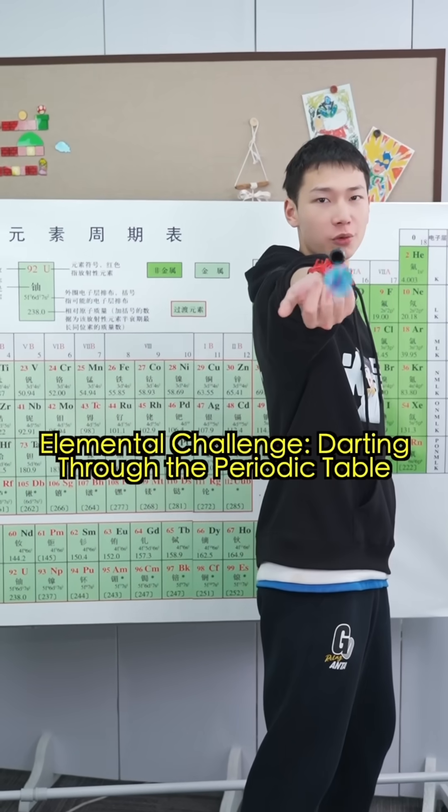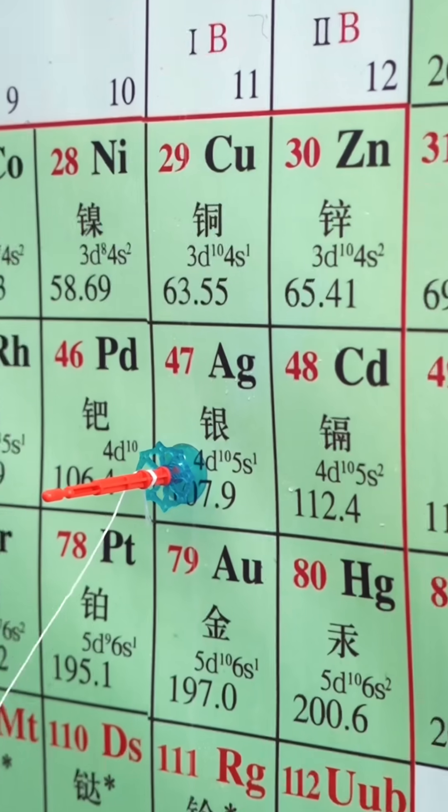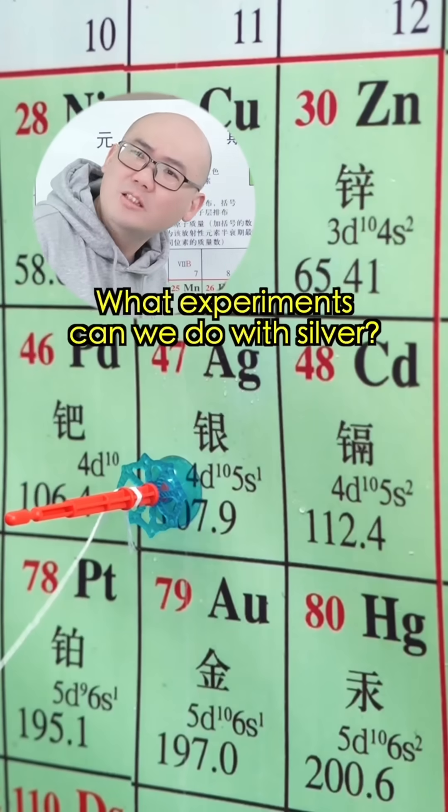Elemental Challenge through the Periodic Table, episode 5. You can conduct experiments with whatever's his. Silver? What experiments can we do with silver?